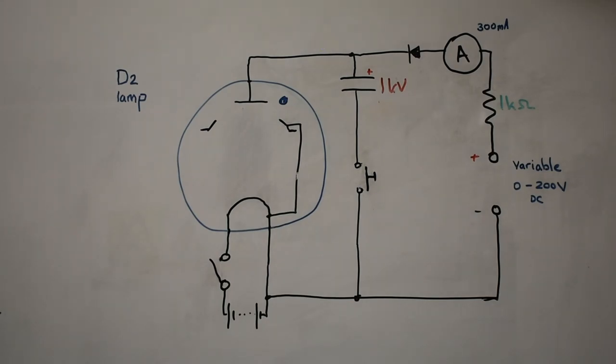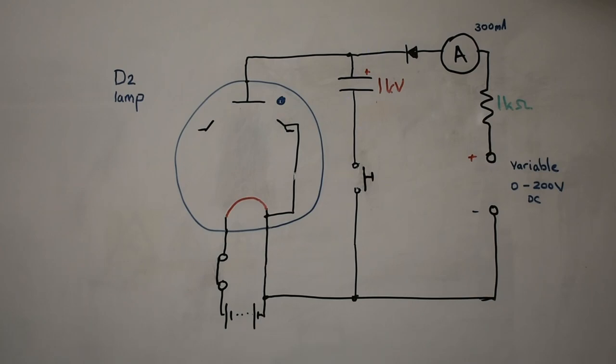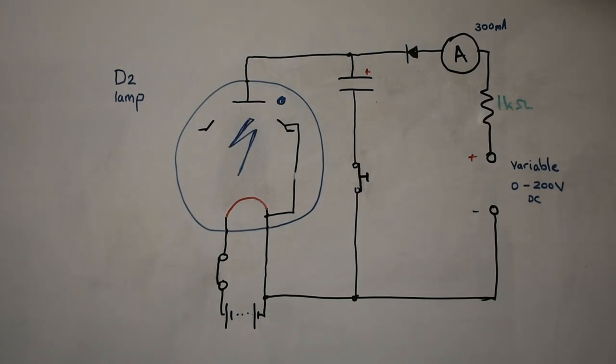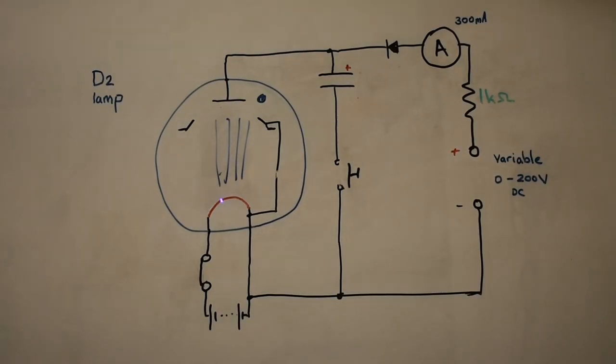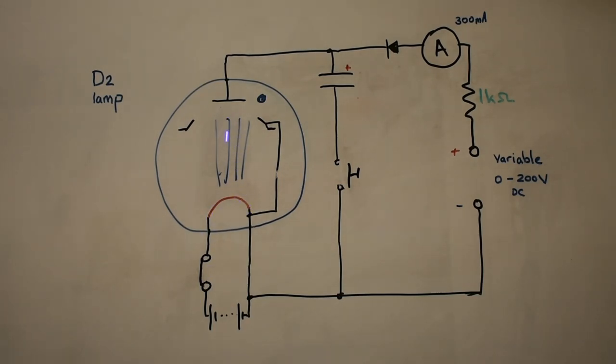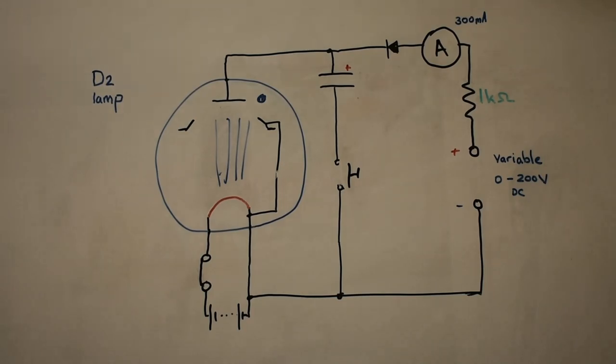So first of all with the cathode heated and up to temperature we can then initiate the strike voltage to start the arc. With the arc struck you can also reduce the current to the heater because the ion bombardment from the deuterium will actually sustain this thermally emitting electrons.